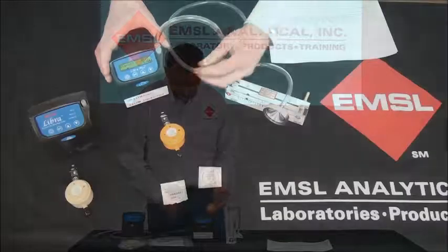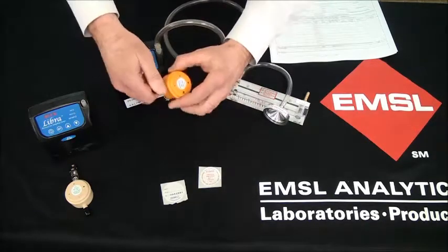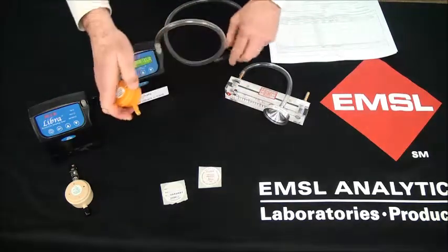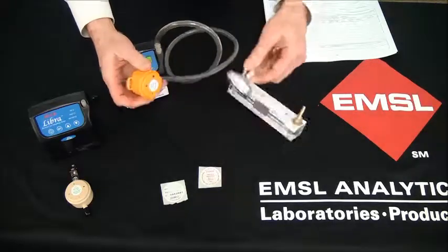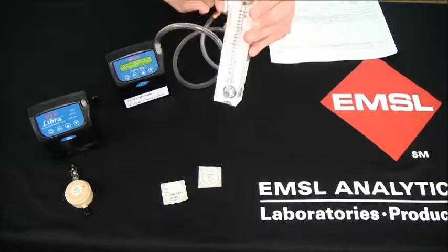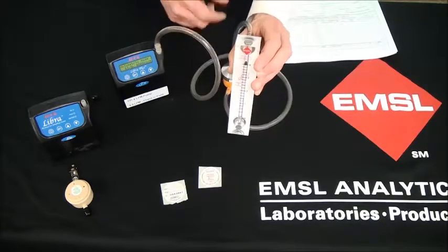To start the sampling, turn on your pump, remove the inlet cover, and attach it to the pump. Connect the rotometer calibration adapter to the face of the PPI and adjust the flow rate to 4 liters per minute to the center of the ball.